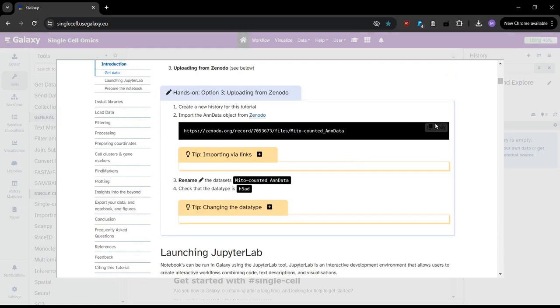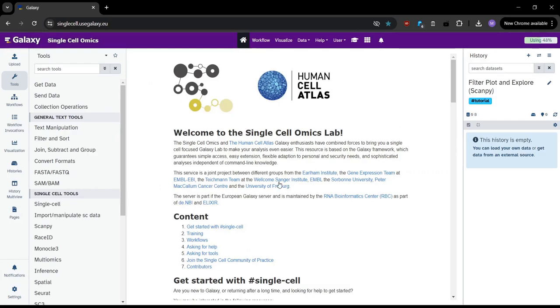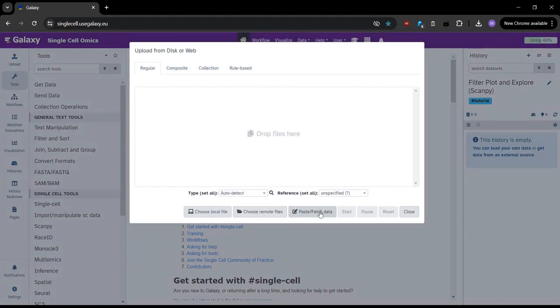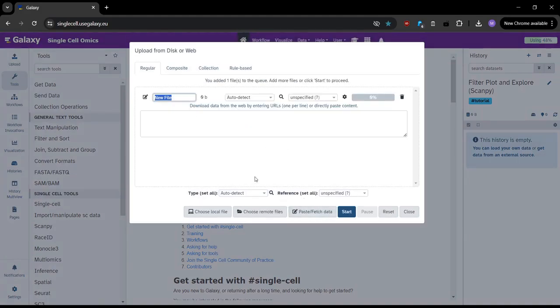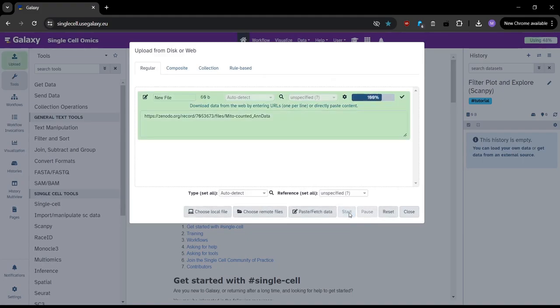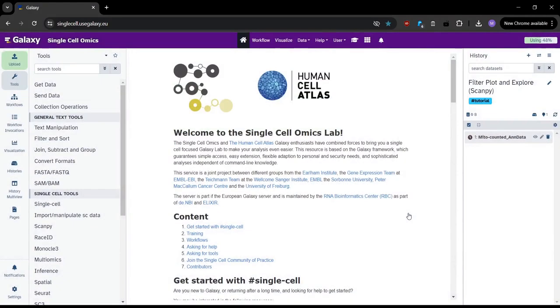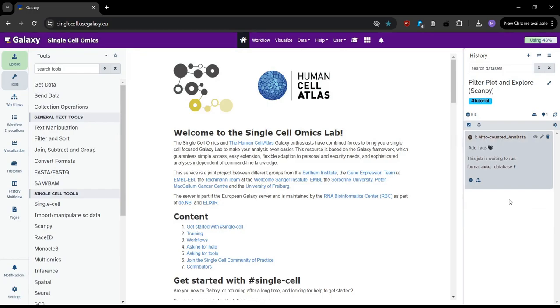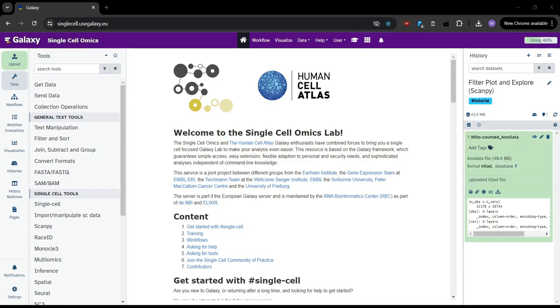So the first step will be to load our data, so we can go and copy. If we just click outside of the window, that will take us back to our Galaxy instance. We can then go to upload, paste and fetch data, and we can paste in our link. Then we click start, and then it goes green. We can close this window. We can see it appears in our history. So currently it's gray, that means it's waiting to run. Once it turns orange, that means the data will be loading into Galaxy. And then green means the data is fully loaded. So we can just go ahead and wait for the data to load.